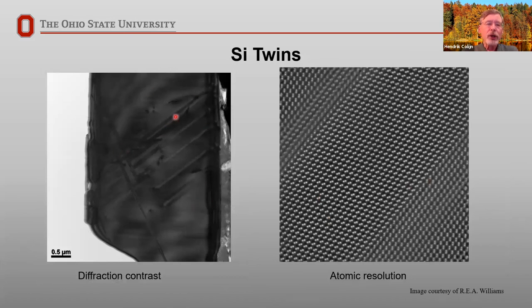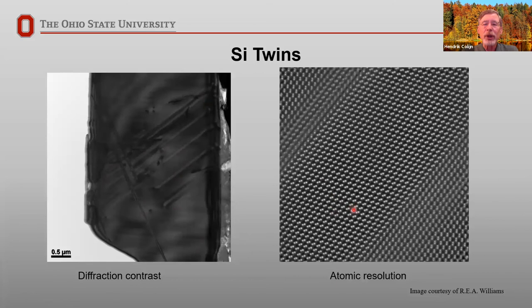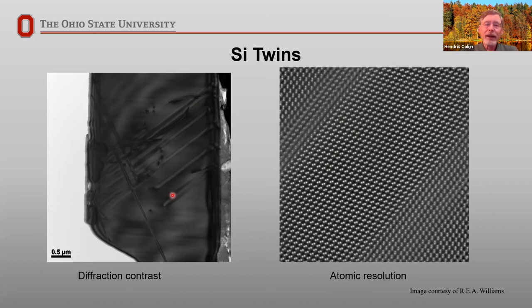Since we're seeing diffraction contrast, we can also look directly at the diffraction pattern of the sample to extract crystallography. Here we can see a mirror across a plane, telling us that's a twin in my sample — extracting crystallographic information from both the image and the diffraction pattern. We can see twin contrast in diffraction contrast images of silicon, and if we work at atomic resolution we can see the silicon 110 dumbbells — the actual atoms in the bright spots — and observe that the dumbbells are mirrored with respect to each other across the twin plane. You can do this at atomic resolution, or work less hard with diffraction contrast and get mostly the same information.